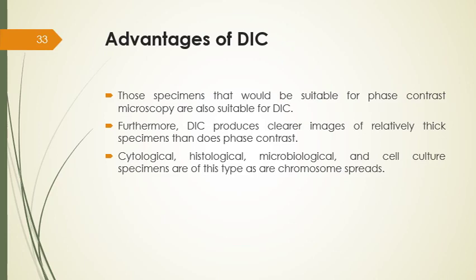One of the major advantages of differential interference contrast microscope is examining living specimens, when normal biological processes might be disrupted by normal staining procedures. It is also very effective in different types of studies like cytological, histological, microbiological, and cell culture specimens.